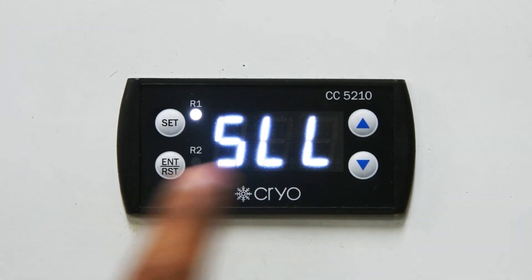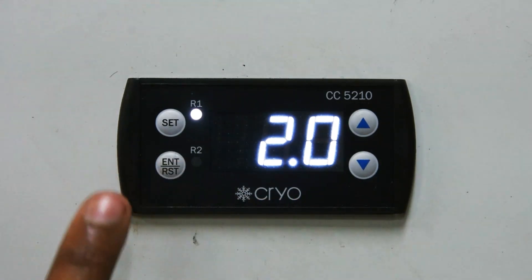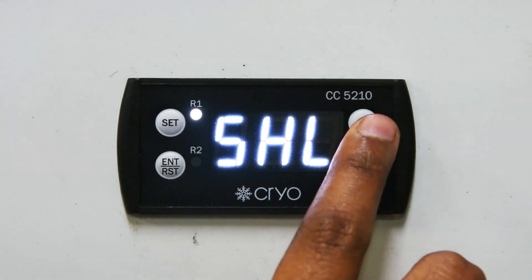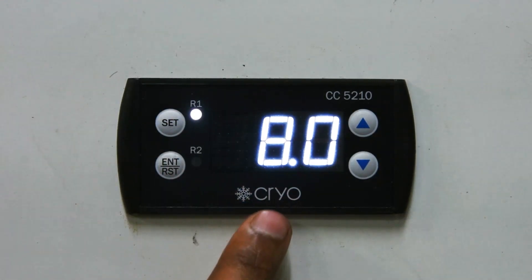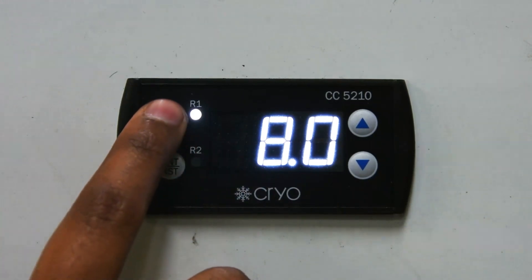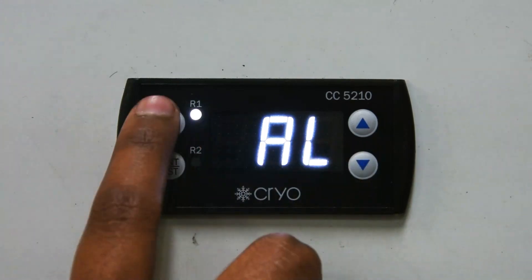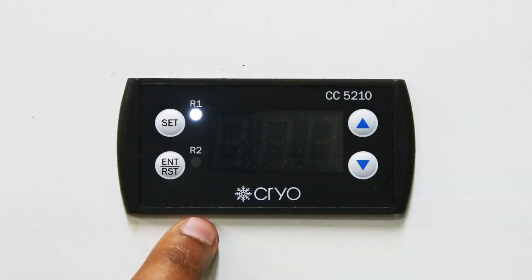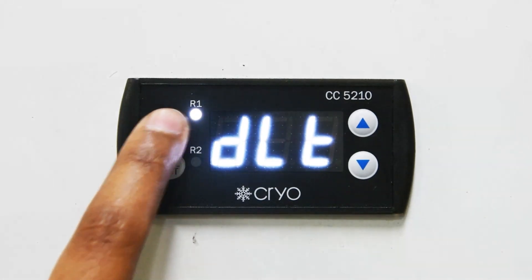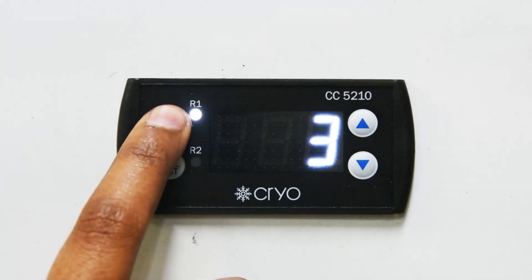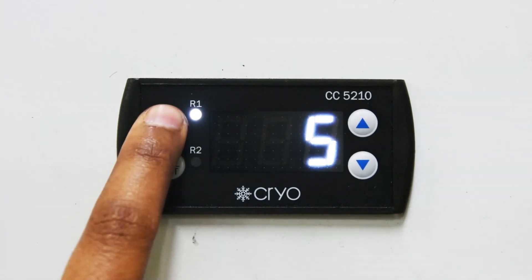The first parameter is SLL — Set Low alarm Limit — which should be 2. Next is SHL — Set High alarm Limit — which should be 8. Next is AL, and that setting should be HL. Next is the delay parameter DLT, which should be 3. Next is alarm time ALT, which should be 5.